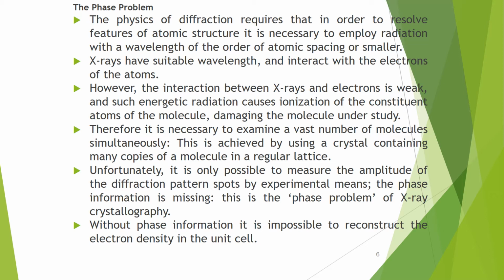The physics of diffraction requires that in order to resolve features of atomic structure, it is necessary to employ radiation with a wavelength of the order of atomic spacing or smaller. X-rays have a suitable wavelength and interact with the electrons of the atoms.